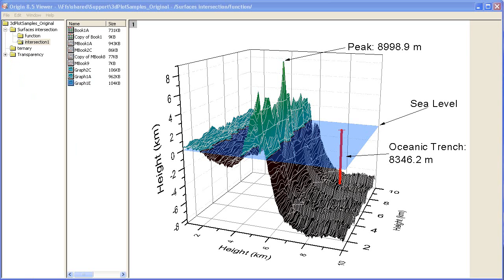With Origin Viewer installed, your co-workers can open and navigate your Origin Project exactly as you created it. They can view your graphs and even copy worksheet data.